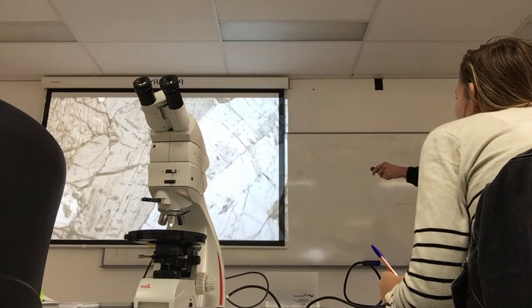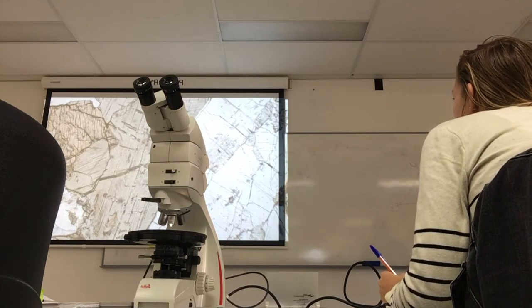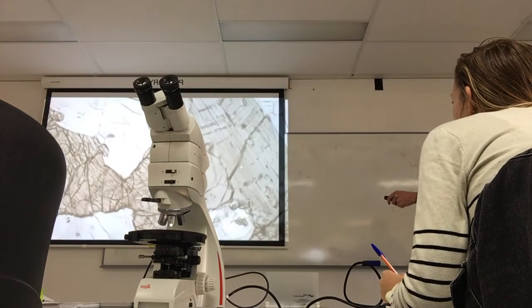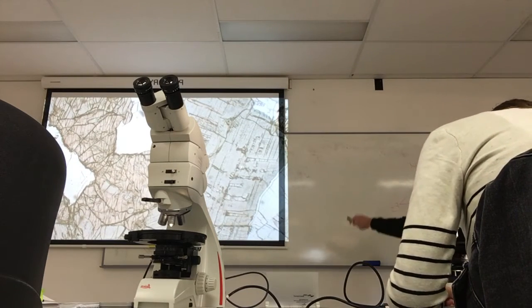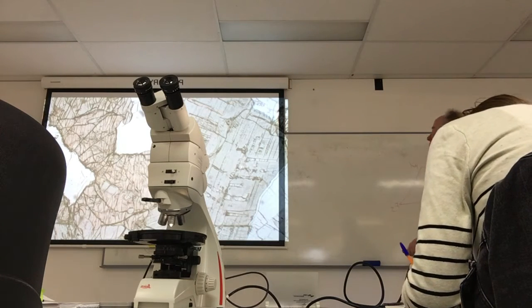That whole grain up there, so this whole grain here is an orthopyroxene. You can see it changing. It looks more green when you're moving. See how pink that is there? So that's changing quite markedly, but that's the whole grain that's changing there. So that's not subcalcic augite, that's down here. So what's the pink?